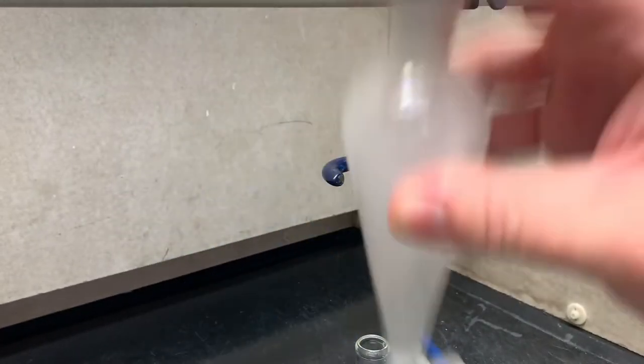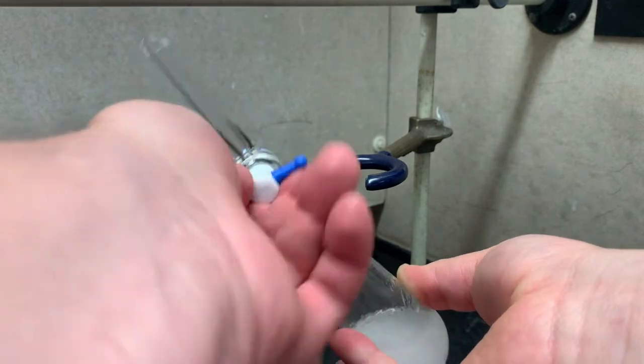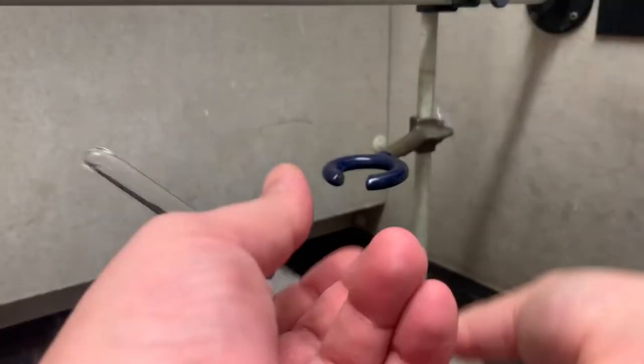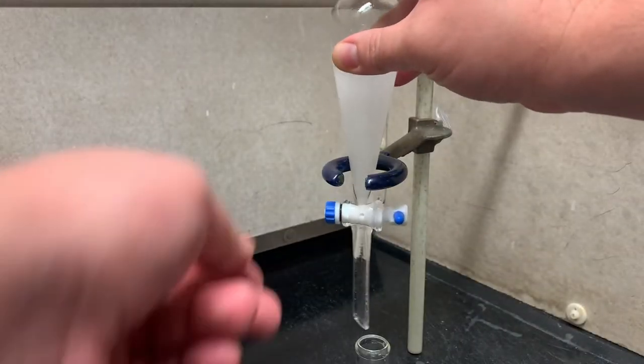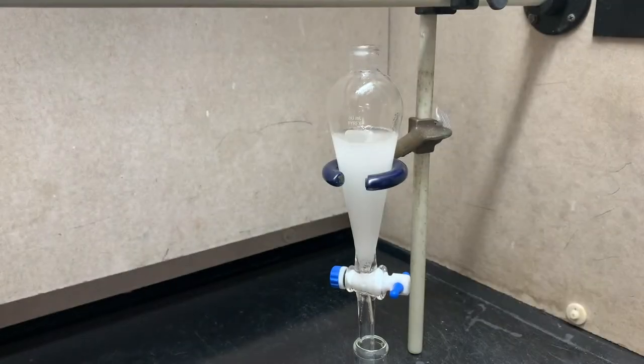Shake, shake, shake. Shake your separatory funnel. Invert, degas, shake, degas, shake, degas. Let's separate, make sure, take that off.